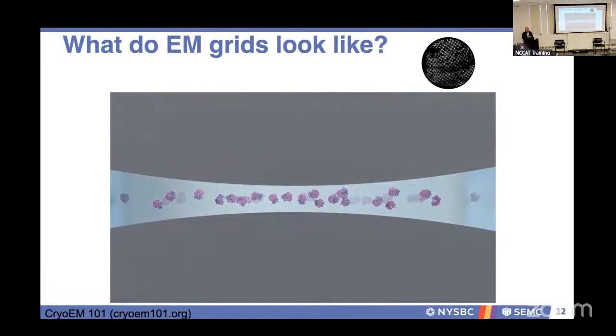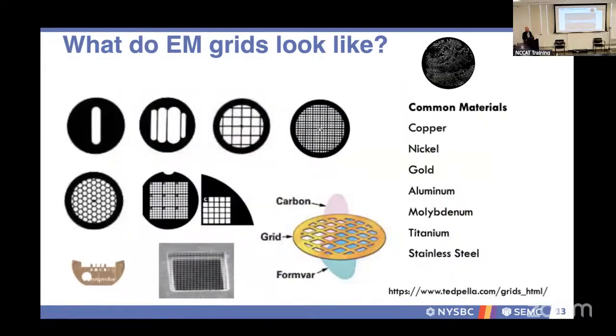And I'll get into a little bit more about that grid after we see the overview of what a grid looks like. In terms of EM grids, we are borrowing a lot not only from material science for single particle analysis workflows, but from the room temperature EM crowd, in the sense that we have many different form factors of EM grids, and they're made of a wide variety of materials.